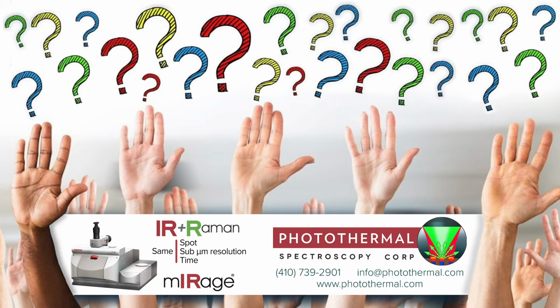And when you say water, do you mean cell media? They're in a buffer solution, so it's not cell media. We have put it in the paper, and Alice has done various biological tests. I can't remember which one, but it was a trypan blue exclusion assay and a couple of others as well, because that was one of the things we were really interested in, to make sure that the cells are alive.